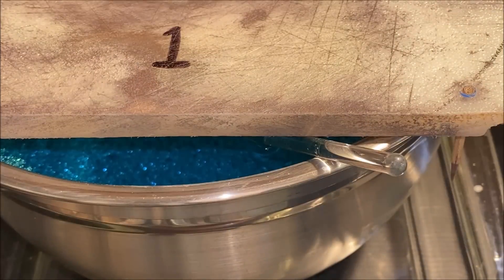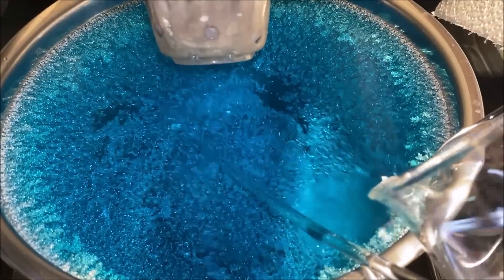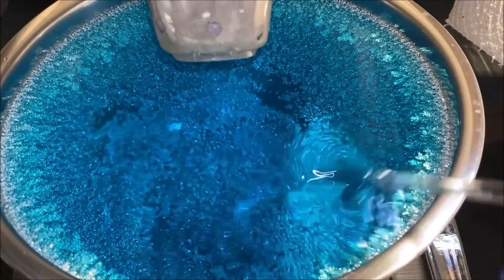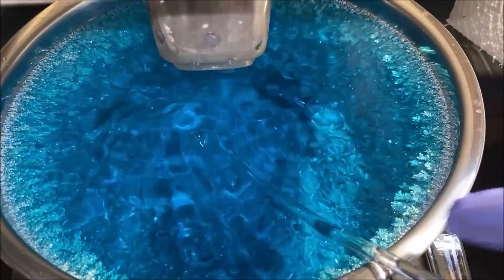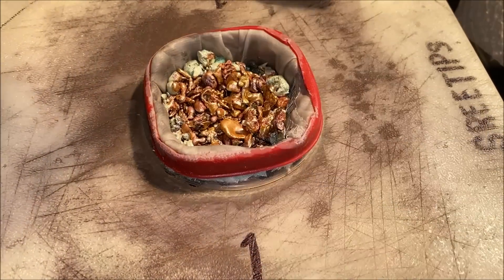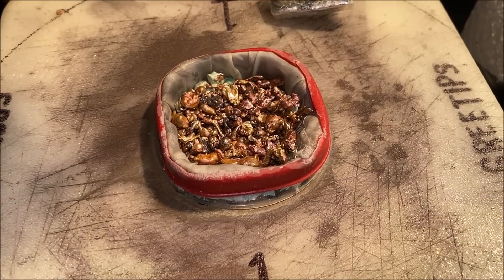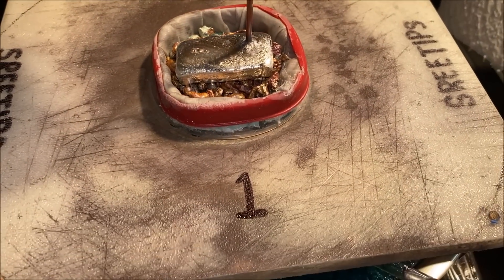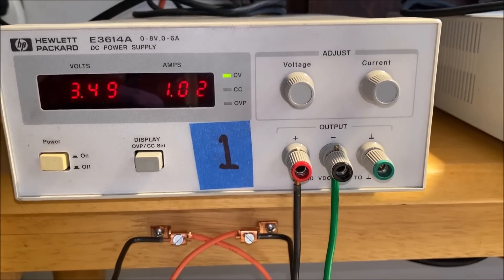Here's silver cell number one — let's see what we've got. Yeah, that looks pretty good, looking real good down in there. Give this a little dose of electrolyte and stir it up. Go ahead and add a little bit of silver — maybe one spoon in here. Current flow is at about one amp for silver cell number one.